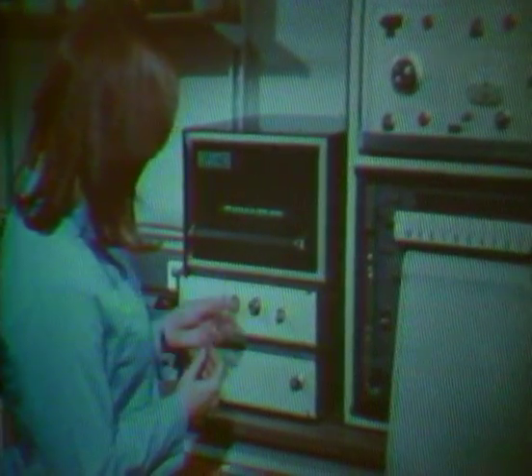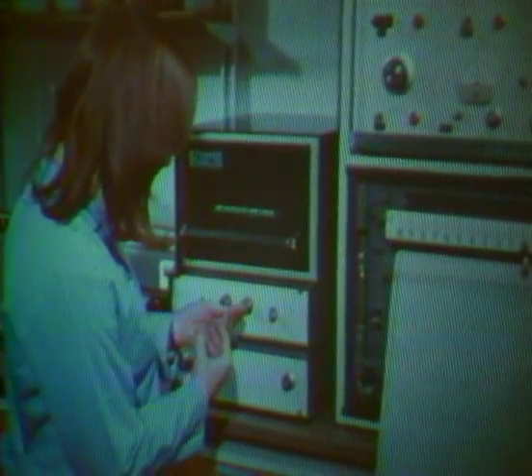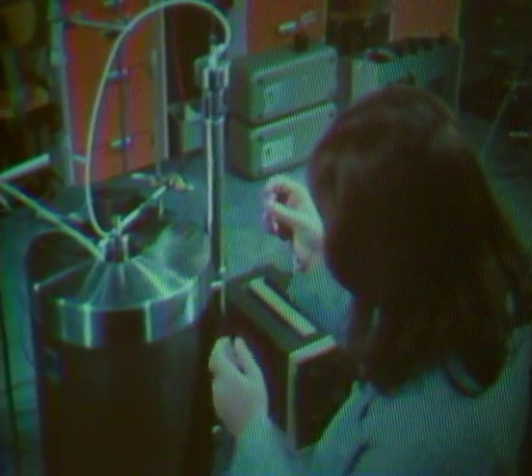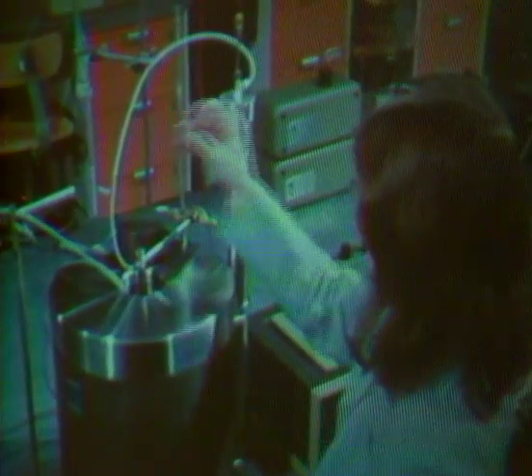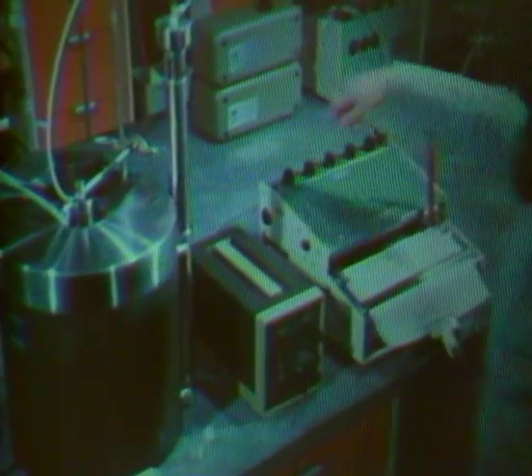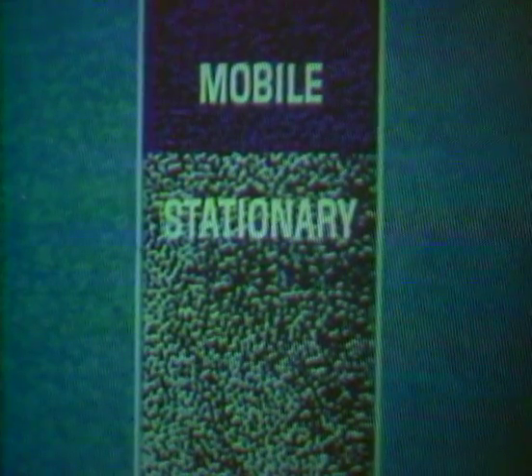In part one of this film, we discussed those chromatographic techniques in which the mobile phase is a gas. In this part, we shall discuss the use of a liquid as the mobile phase. This is liquid chromatography. Its principles are the same as in gas chromatography. The sample components are separated by distribution, either by partition or by adsorption between two phases. The fundamental difference between gas and liquid chromatography is that here a liquid serves as the mobile phase.